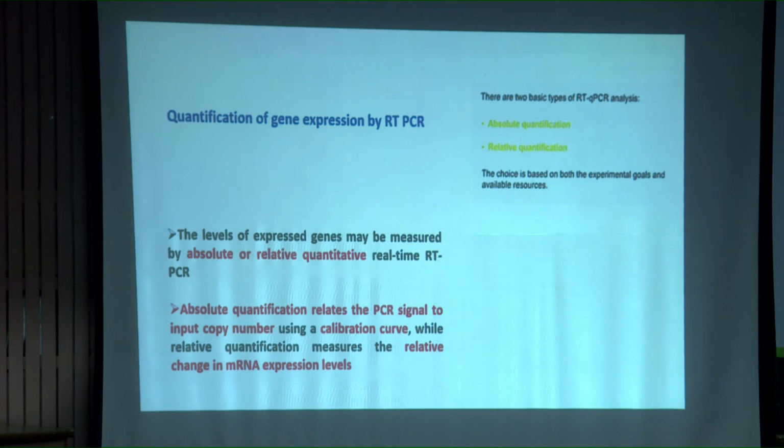If you want to estimate this, you decide which fungi you want to look at, as you must be working with some fungi. Let us take the example of Fusarium. You want to know how much Fusarium is there in a particular sample. If you have a specific primer which specifically amplifies the target fungi, with that information you can quantitate how much Fusarium is there in that particular niche. This is one of the direct applications in plant pathology.